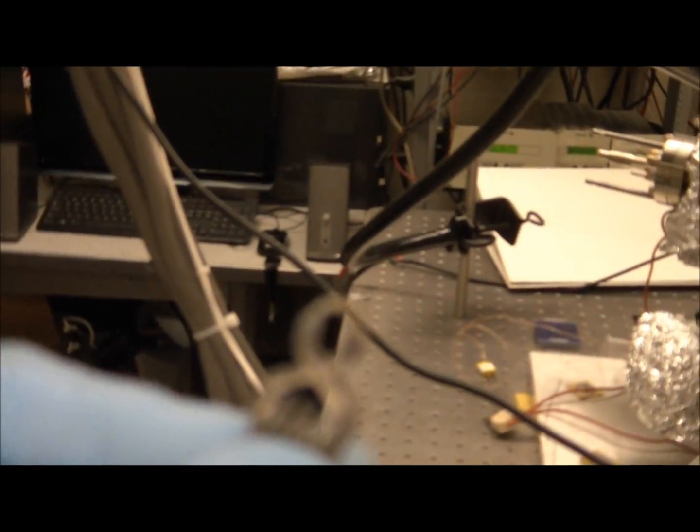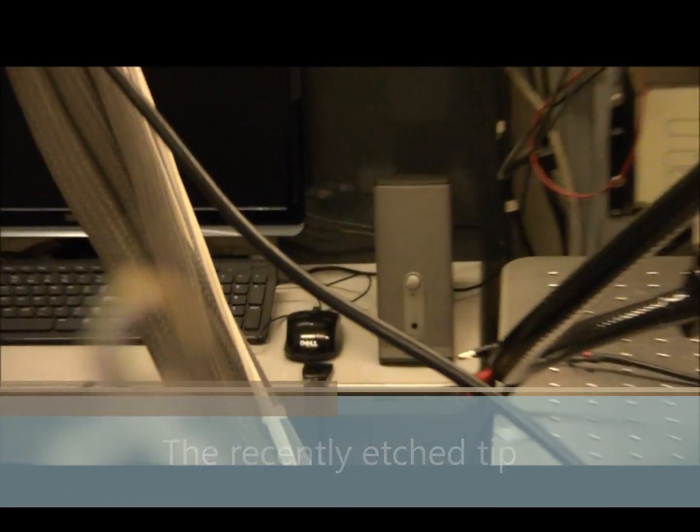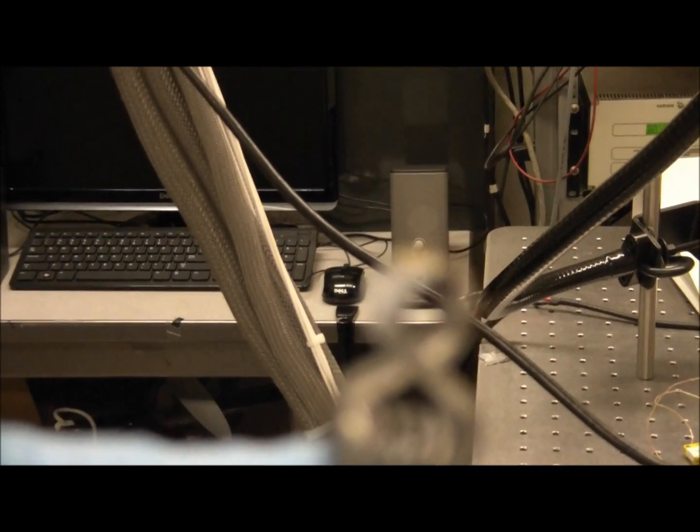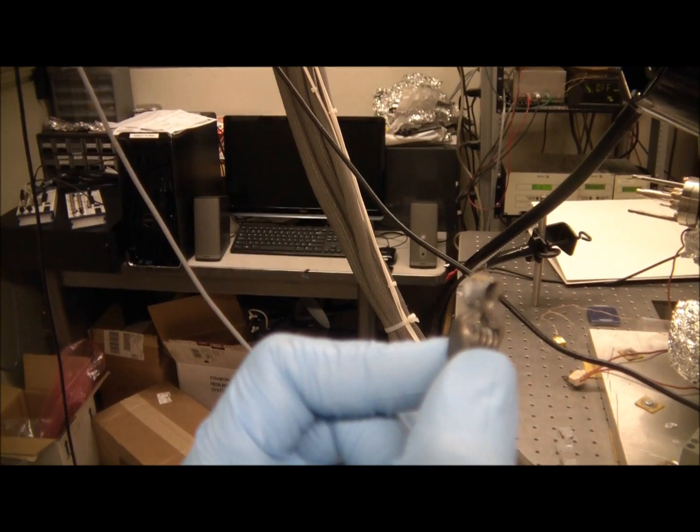As you can see, the tip here is very delicate, very fine. It's so fine actually, I can't even focus with the camera. Okay, there it is.